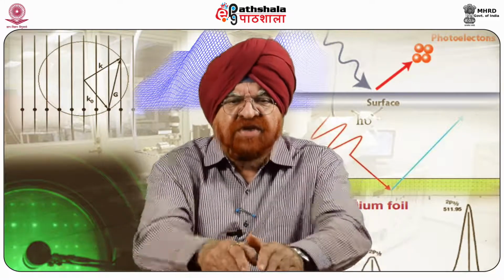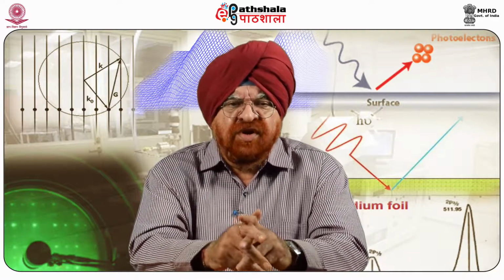The effect of manganese on the formation of these magnetic vortices is also remarkable, suggesting that once the structure is formed, the Mn distribution is non-uniform and/or highly influenced by the presence of MnSi 1.7 around it.